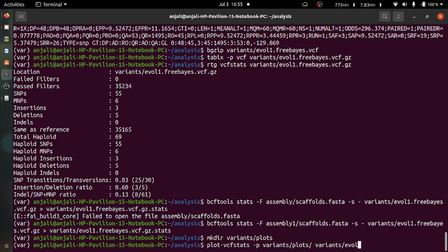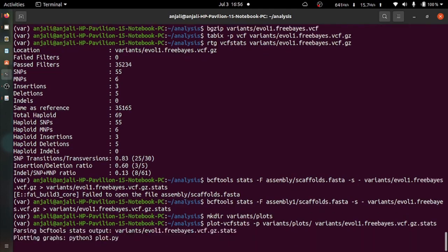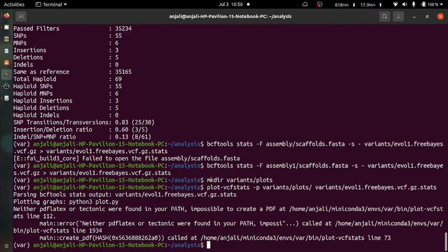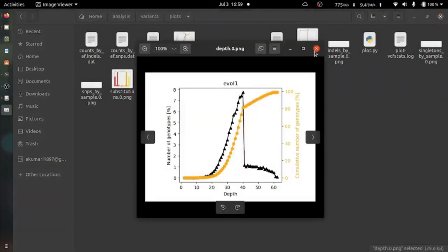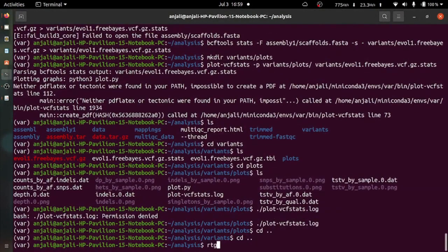Let's also create a new directory for the variants. We can call variants with a tool called FreeBayes. Given a reference genome scaffold file in FASTA format, for example scaffolds.fasta, and the index in .fai format, we can call variants with FreeBayes and pipe the results into a new file. -p 1 specifies the ploidy level. We know E. coli are haploid.